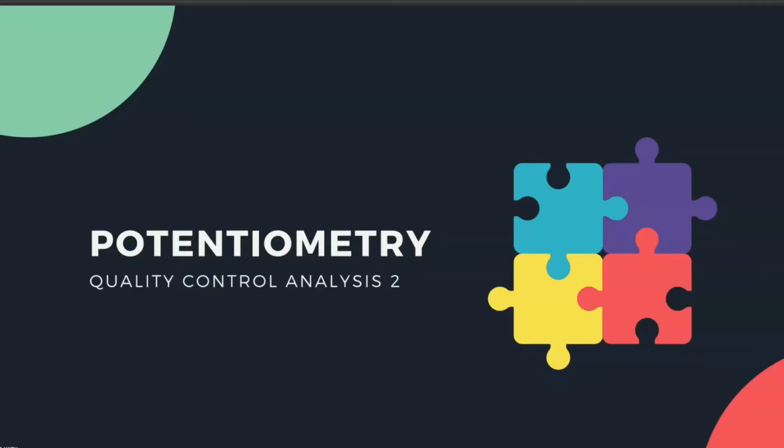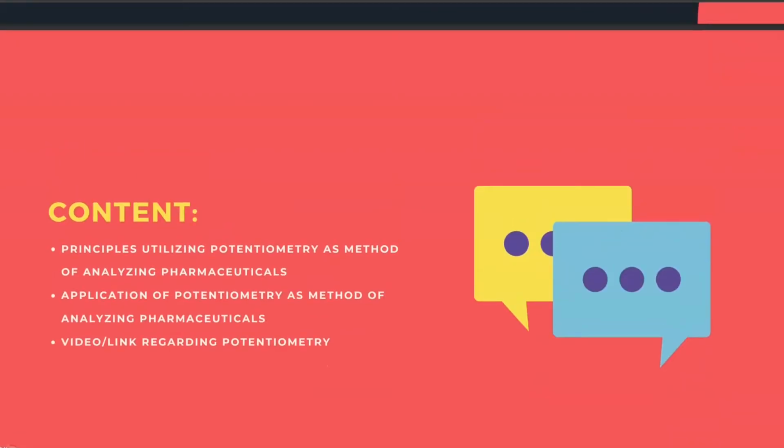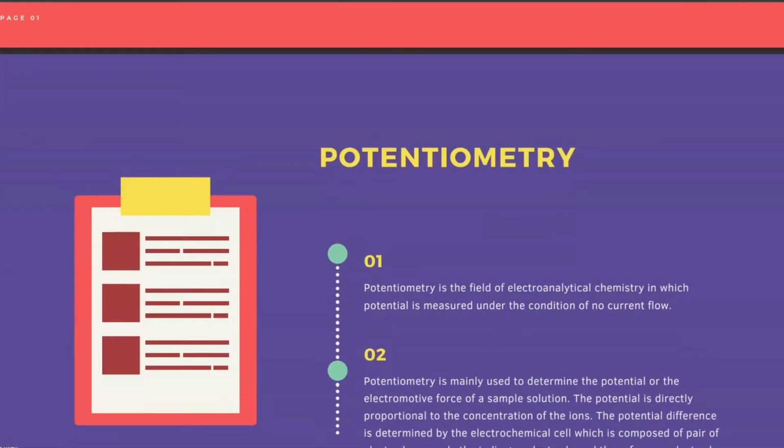So good day guys, today we're going to talk about potentiometry. The content in our topic for today are the following: the principles of utilizing potentiometry as a method of analyzing pharmaceuticals, and the application of potentiometry as a method of analyzing pharmaceuticals. And we also have a video or link that you can watch regarding potentiometry for further knowledge if you want to learn more about potentiometry.